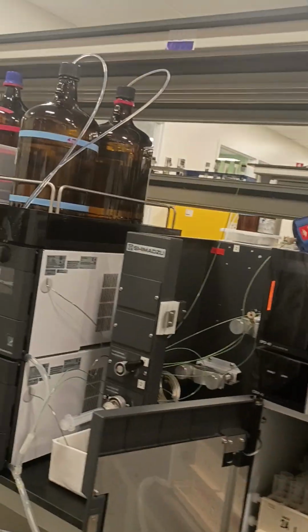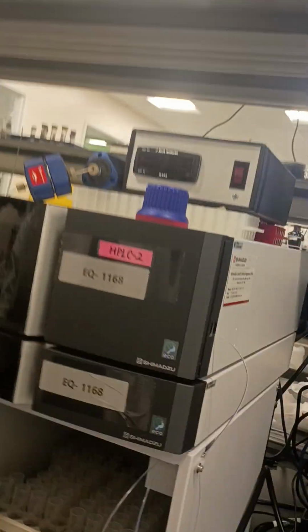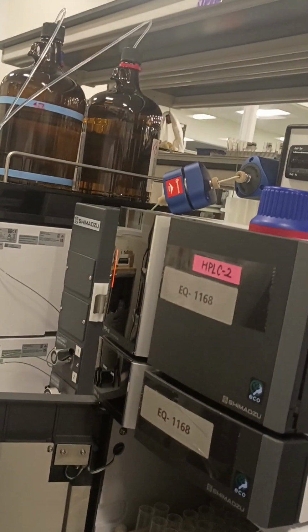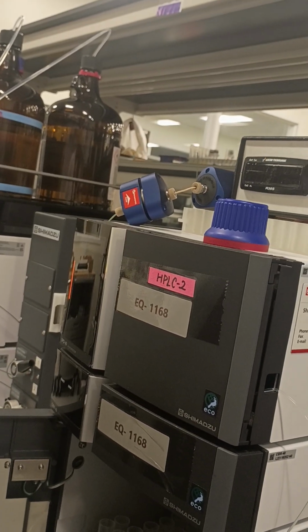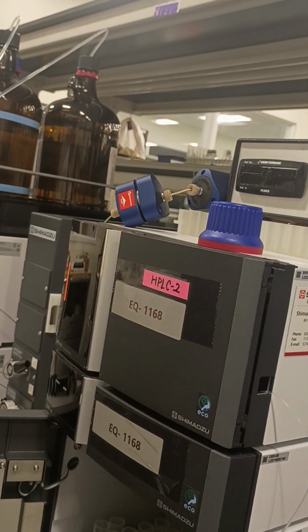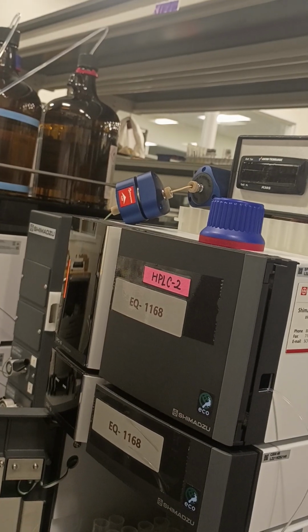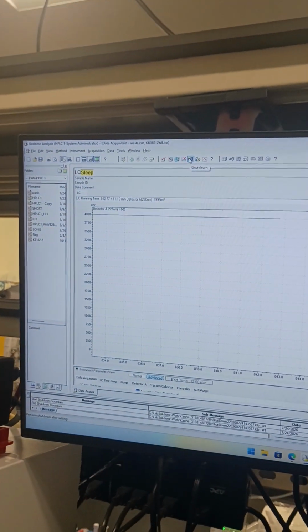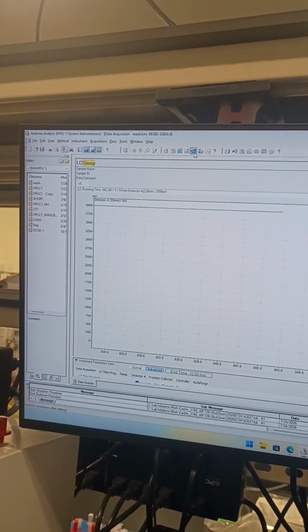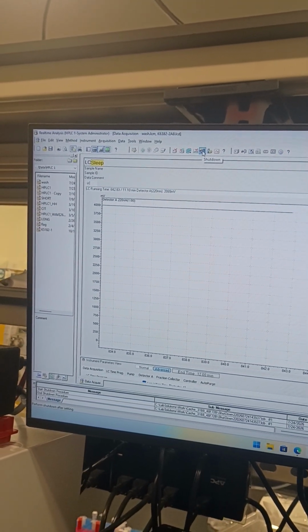Everything is supposed to be off. Every equipment is controlled by one computer. What you see is a bunch of shutdown buttons. In this case it's in sleep, meaning it's closed, but the shutdown button is still right there, the same button. See the yellow icon right there? That's how you know it's a shutdown. If you put the cursor on it, it tells you shutdown.